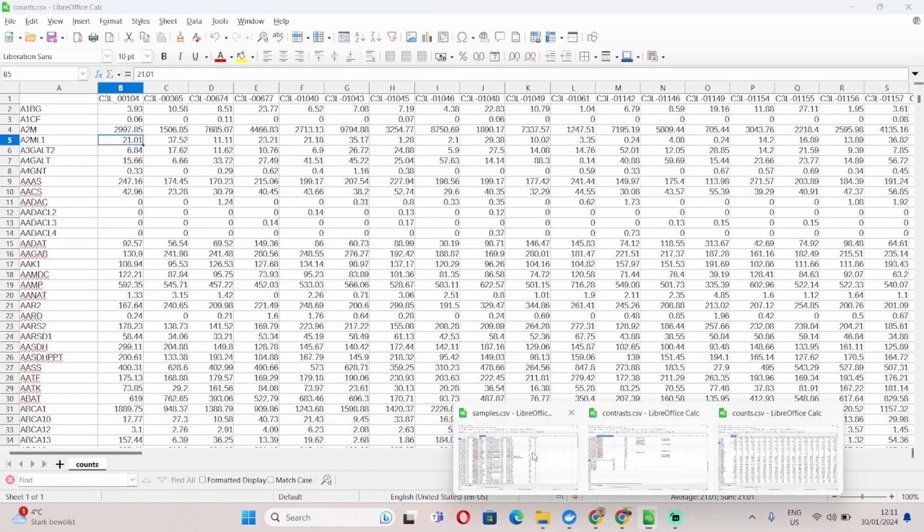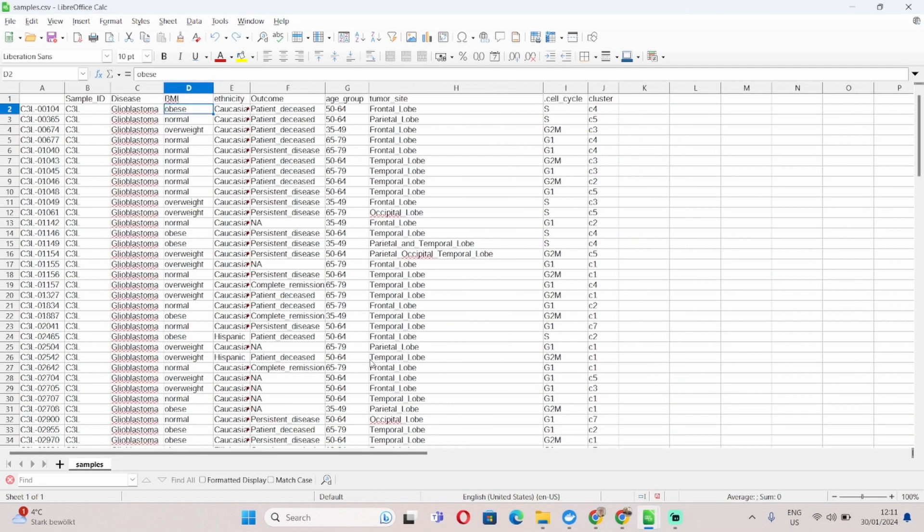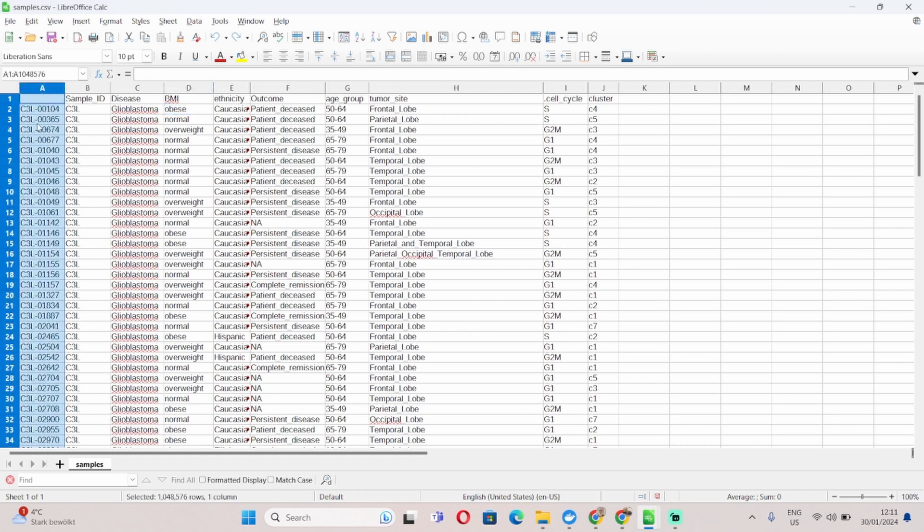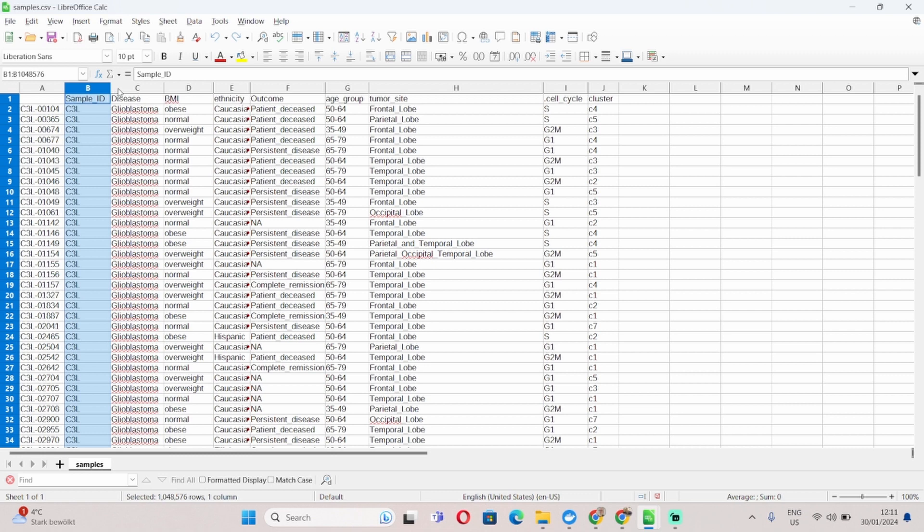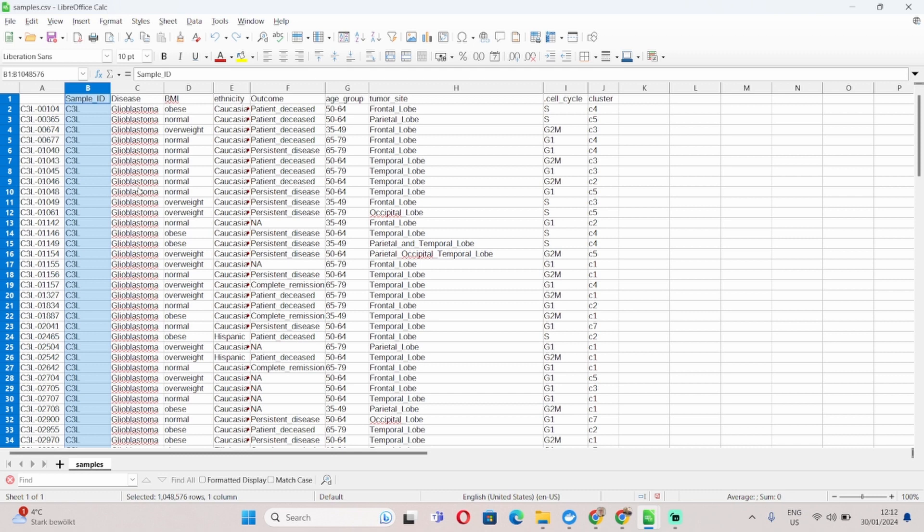Next we have the samples file. This is the file that contains the actual phenotypic information about your samples. The structure is that in the first column you will have your sample IDs and they have to match the sample IDs in your counts file. And then in each of the following columns you will add your different phenotypes. In this case I have for example sample ID, disease, body mass index, ethnicity, disease outcome, age group, and tumor size.